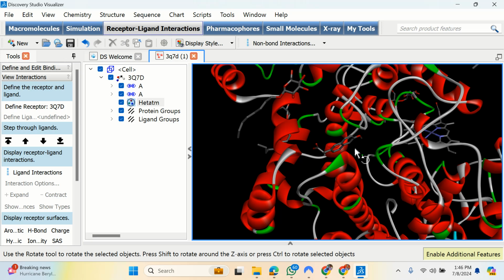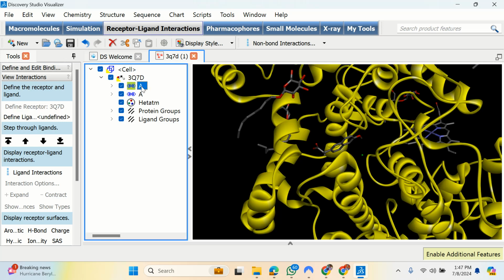Peroxidase is an enzyme. So here now, I know that that active site has arginine 102. What do I do? I'll simply search arginine 102 here, and it will show itself, and I will know if it's here or even here. Do you understand what I mean now? I don't even need to right click here first. I'll simply come to this protein. This is A, the protein, right? We agreed about that, right?